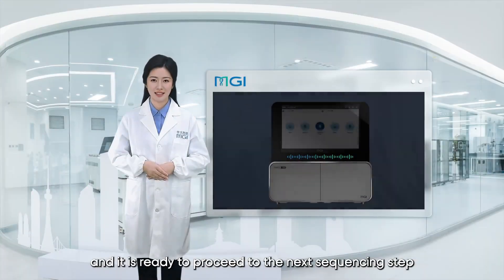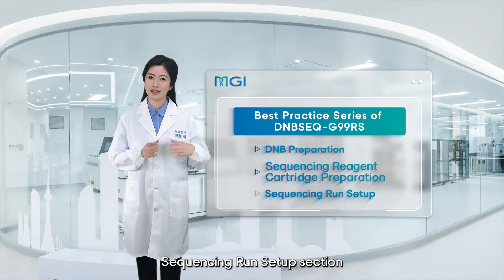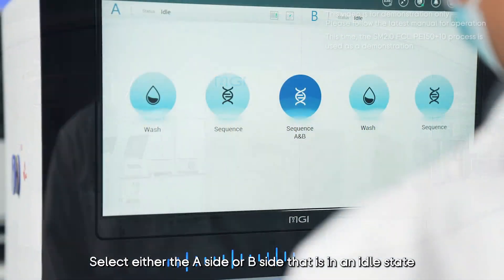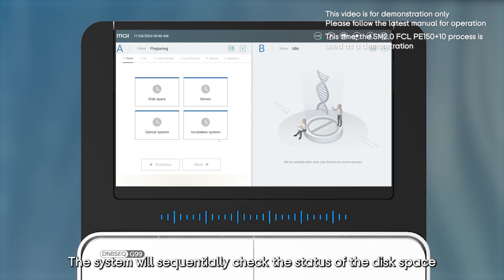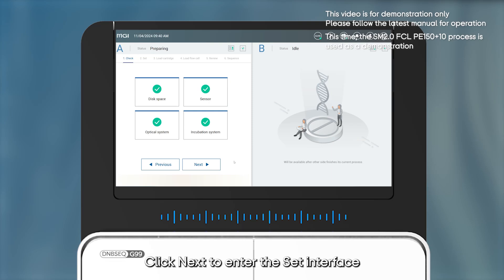With this, the preparation of the G99 FCL PE150 sequencing reagent cartridge is complete and ready to proceed to the next sequencing step. This concludes the second chapter of our demonstration. Welcome to the DNBseq G99 sequencing run setup section. After preparing the sequencing reagent cartridge, log into the G99 sequencing UI software. Select either the A side or B side that is in an idle state to set the sequencing parameters. Click on the sequencing icon to enter the pre-sequencing self-check.